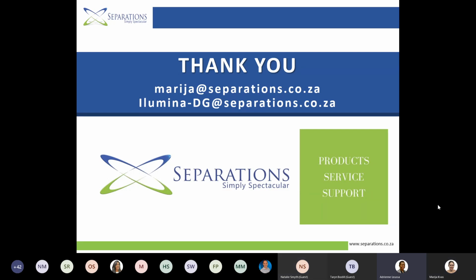Sandy, do you want to share? Yes, so I have a bunch of projects looking mostly at metabarcoding of animals. So we use the CO1 barcode region. And we have projects from fecal samples all the way to looking at zooplankton in the ocean. So at the moment, I'm not sure about whether using the iSeq will be appropriate or using a bigger machine. So that's why I'm in this session, to learn a little bit more about the two machines.